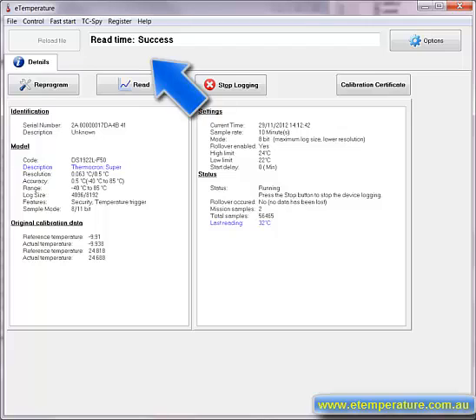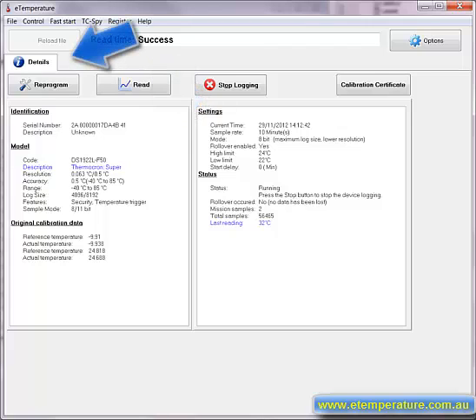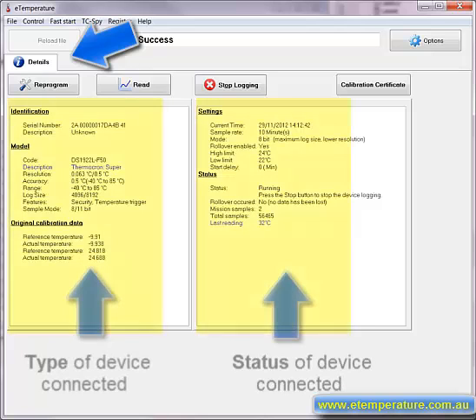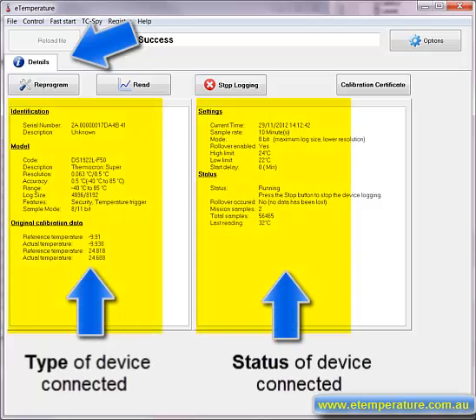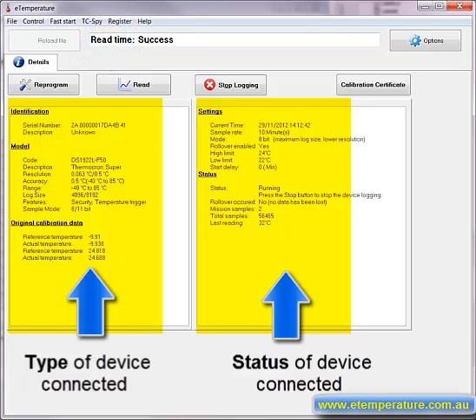The screen will also change to show the details tab. The details tab has two sections of information. The left hand side shows information about the type of device that has been connected. The right hand side contains information about the current status of the device. In this case the device has stopped and we need to restart it.